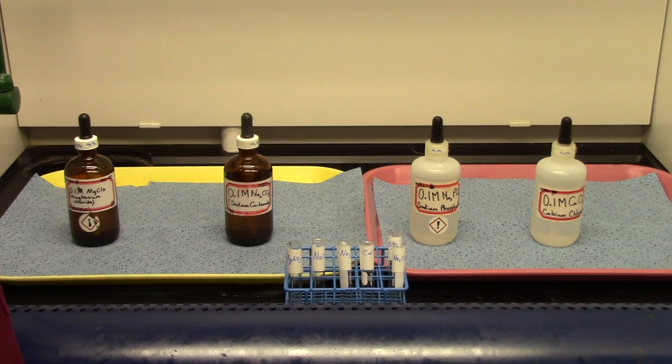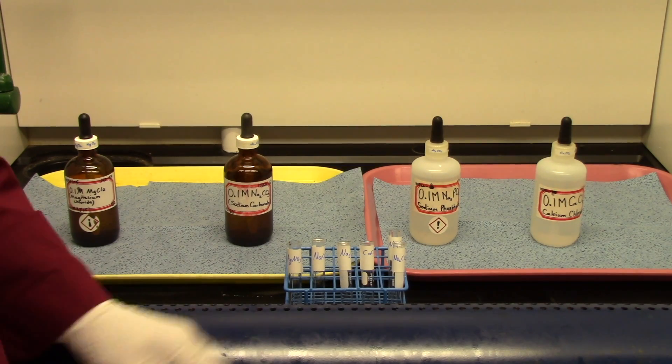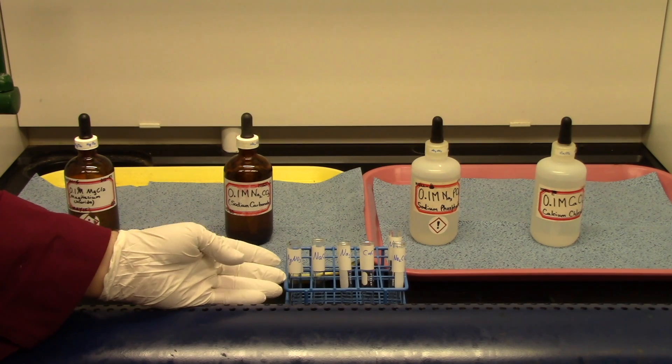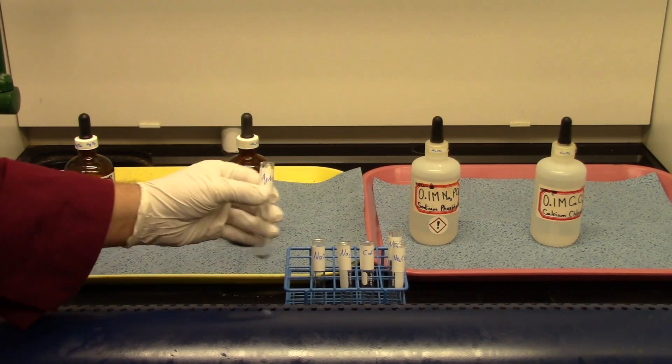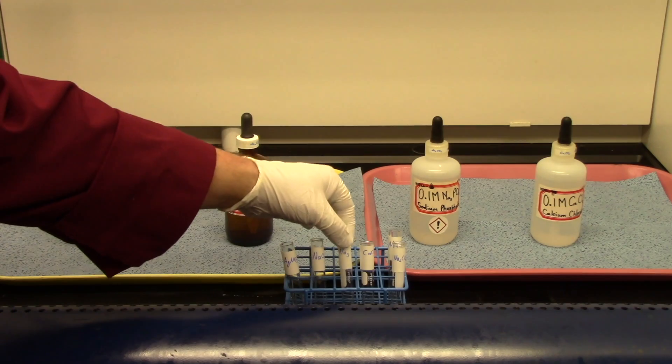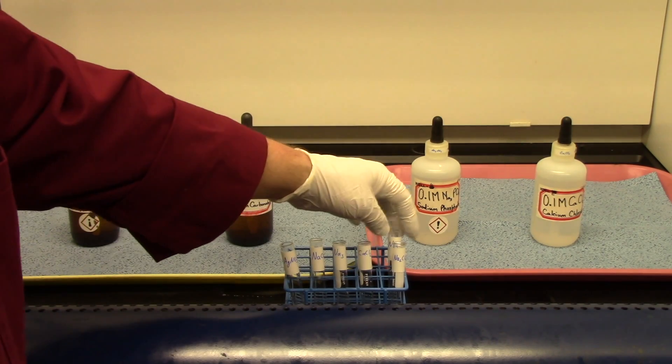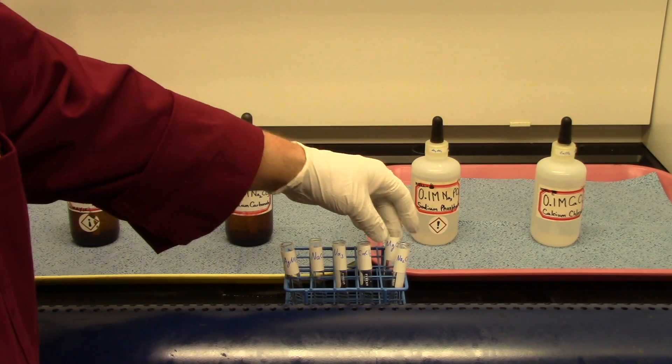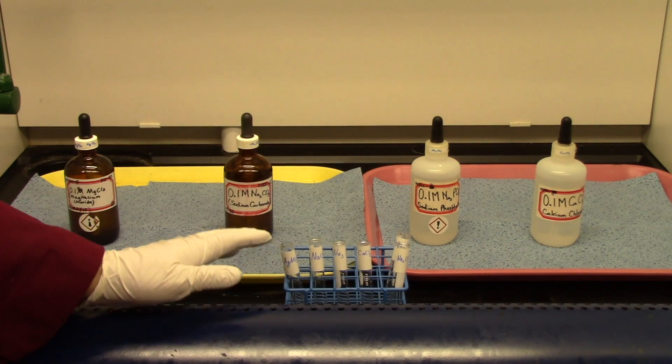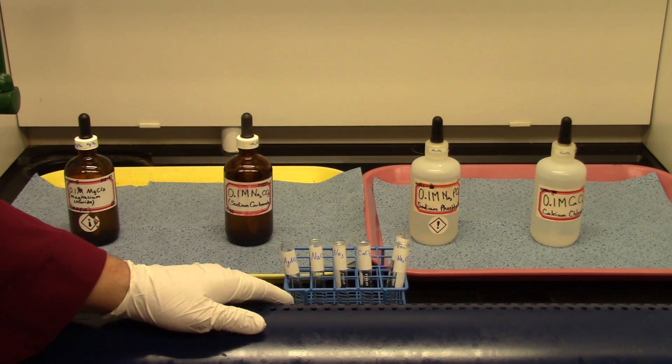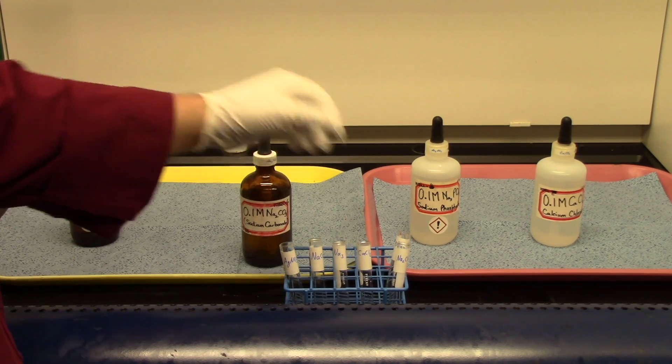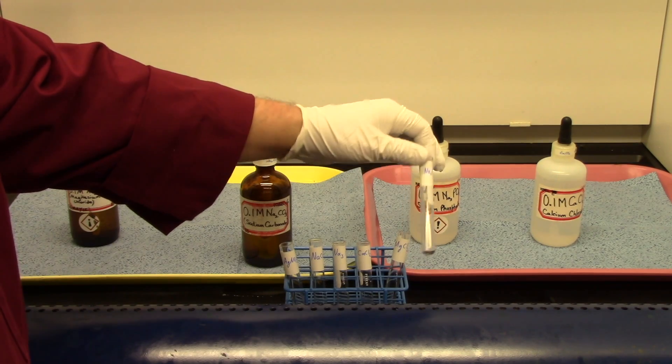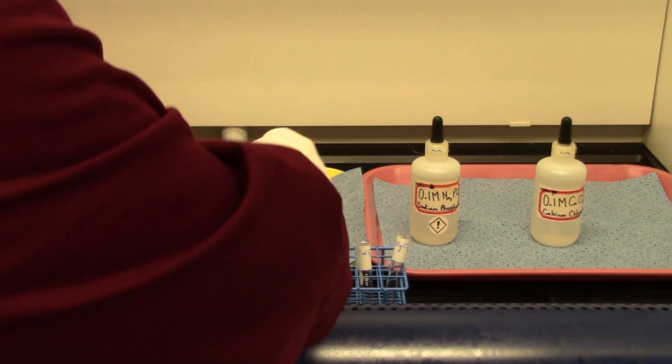Part 2 of today's experiment requires us to put about 0.5 milliliters of six different reagents into six different test tubes. I have labeled my test tubes with labeling tape and a blue marker. So this one here is sodium nitrate, sodium hydroxide, sodium phosphate, calcium chloride, sodium carbonate, and magnesium chloride. I want to be very careful to make sure that the right reagent gets into the properly labeled test tube. For example, here is a bottle of sodium carbonate. I want to take this bottle and make sure it gets into this test tube. Because this is labeled sodium carbonate.